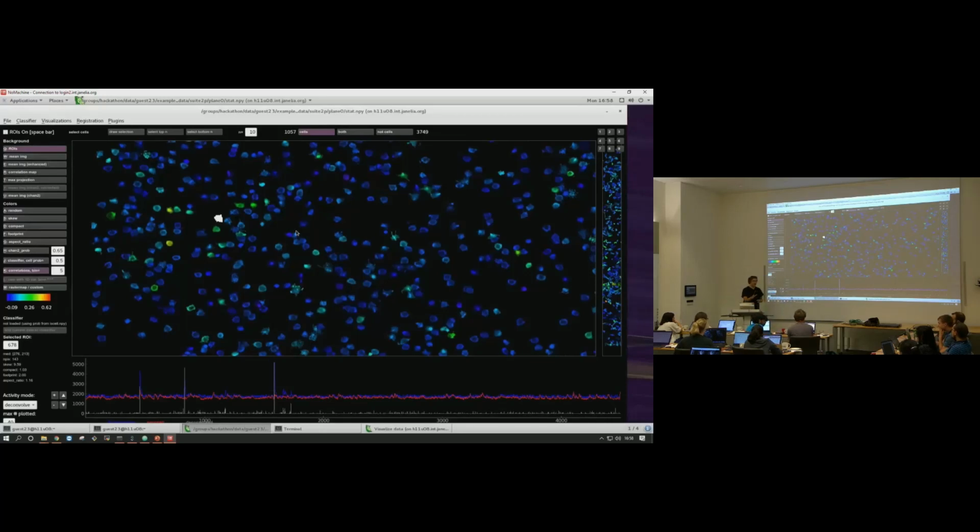Where do we have the ground truth spiking from? Well, we have it from a few cells that were patched here and there. A lot of them here at Janelia in the GENIE program when they were making the sensors. Some of them by other people elsewhere. Together they've put these data sets into part of the Spike Finder challenge, if you guys have heard about that.